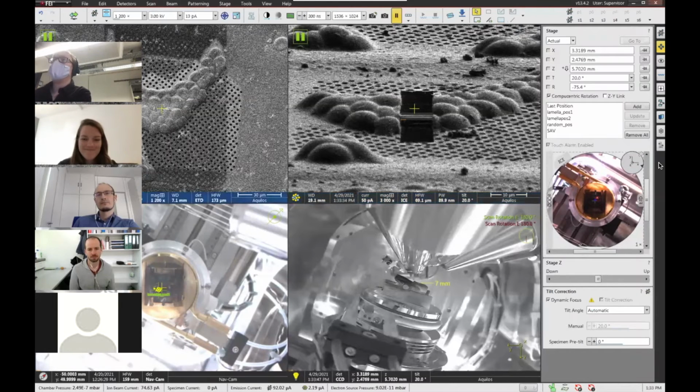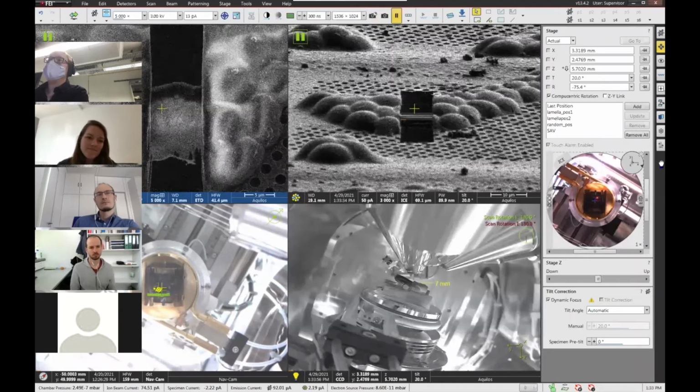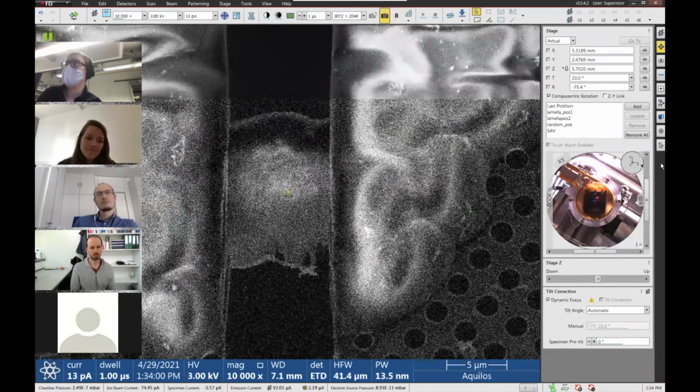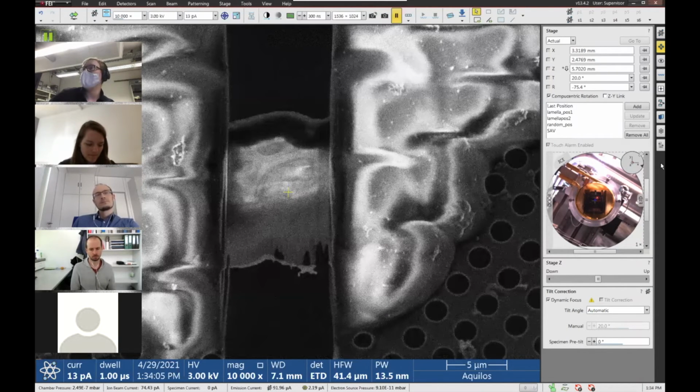And let's see if something decent. So this actually cut into it a little, I think. So my positioning might not be ideal, or maybe playing with the pattern distribution and milling time might resolve that. But in principle, it looks okay-ish. It could have been nicer, but that's what we got right now for this position.